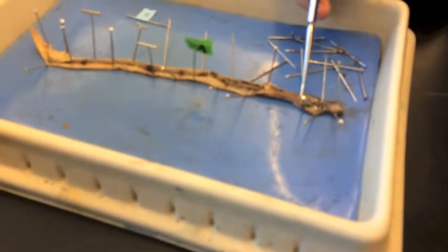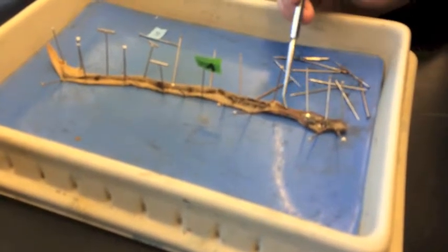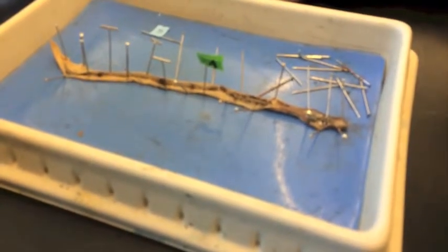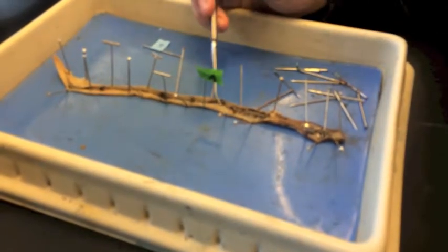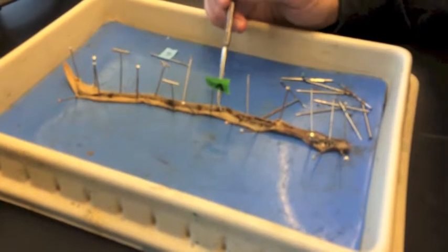Hard structure is a gizzard, which grinds up the food. Crop stores the food, gizzard grinds it up. This dark line is the dorsal blood vessel running along the intestine. Underneath the intestine is a white line, that is the ventral nerve cord. You see all the divisions, which are the annuli.